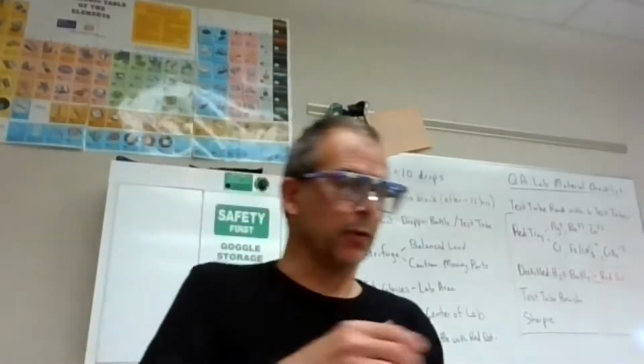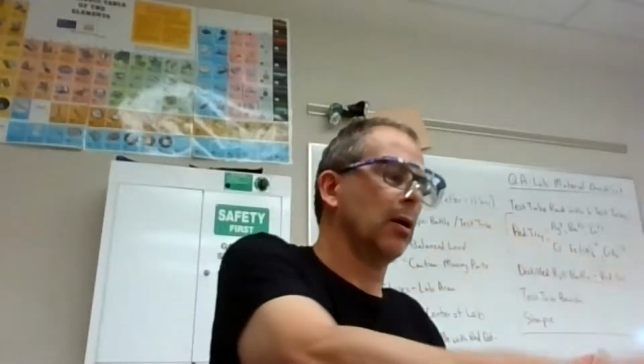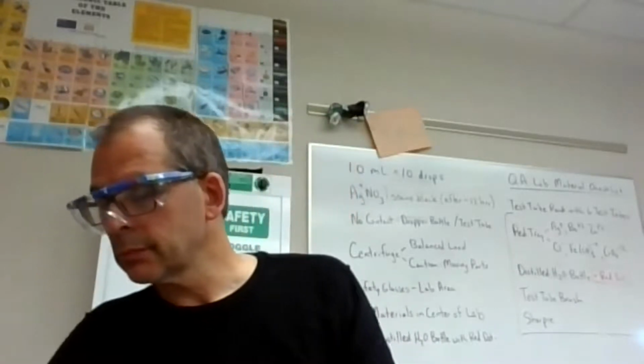I'm going to try to centrifuge that, and so we get a clean look at the next test right there. So I'm going to put that in. That'll give it a little bit more time to respond. And again, that haziness might frost the glass or even sink to the bottom a little bit, and then makes the next test a little easier to see. Giving that a good spin. I think that should be good.